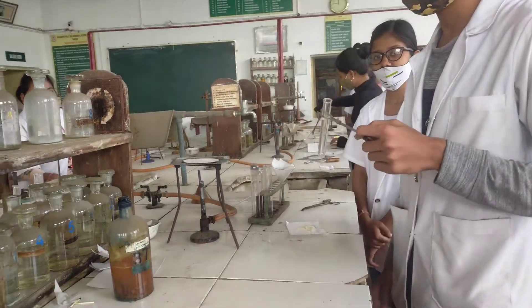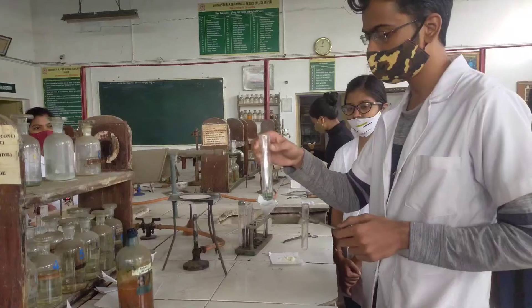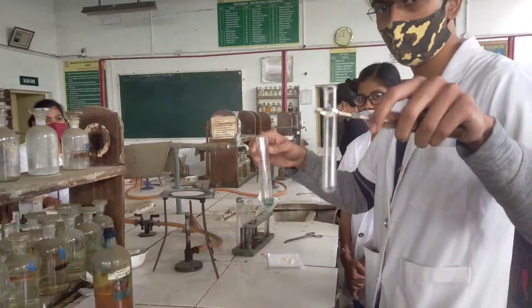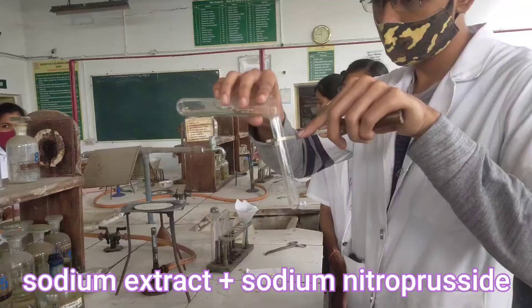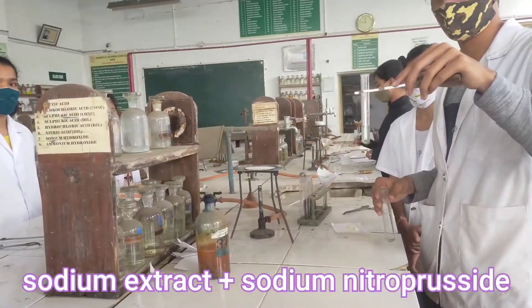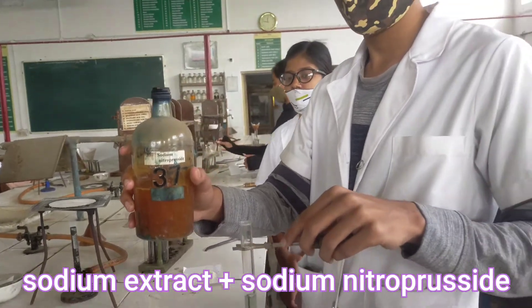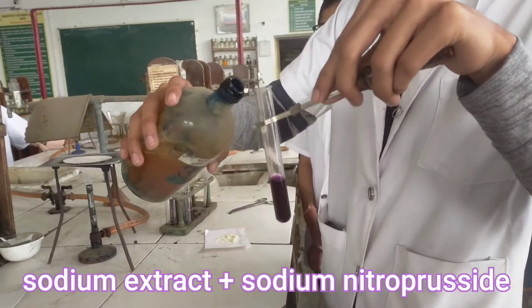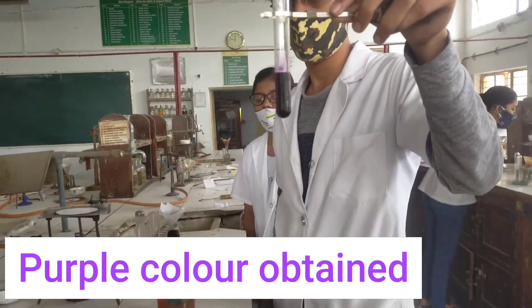We have already prepared our sodium extract. Now, we are going to test the presence of sulfur in our compound. Take a clean test tube and add 1 ml of our sodium extract. Then, add sodium nitroprusside into it. A beautiful purple color is formed, which confirms the presence of sulfur in our compound.